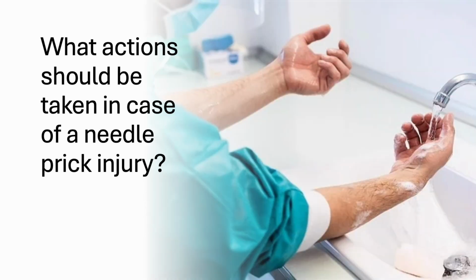In case of a needle stick injury or exposure to bodily fluids, immediate action is necessary. Clean the affected area with soap and water. Flush any splashes to the nose, mouth, or skin with water, and irrigate eyes with a sterile solution. Report the incident to your supervisor and seek medical attention immediately.